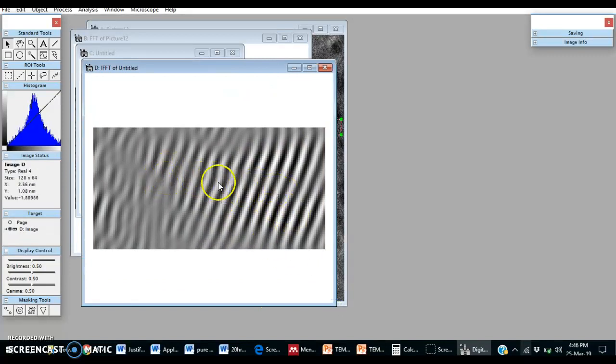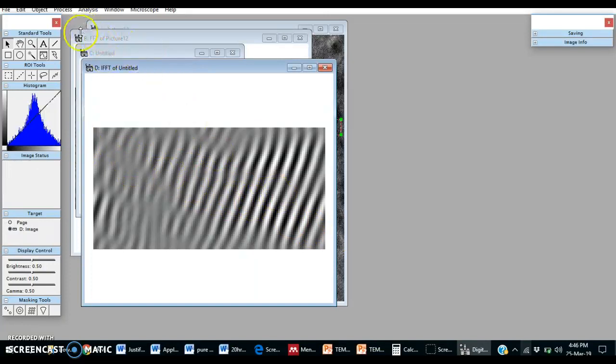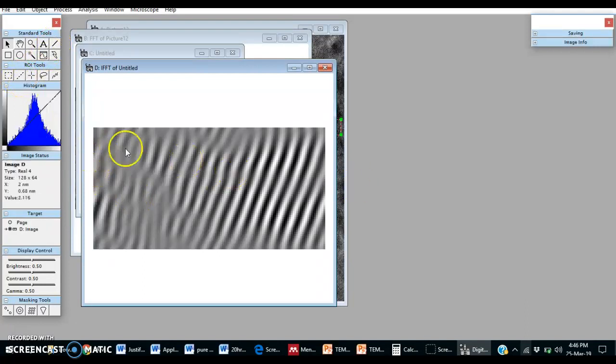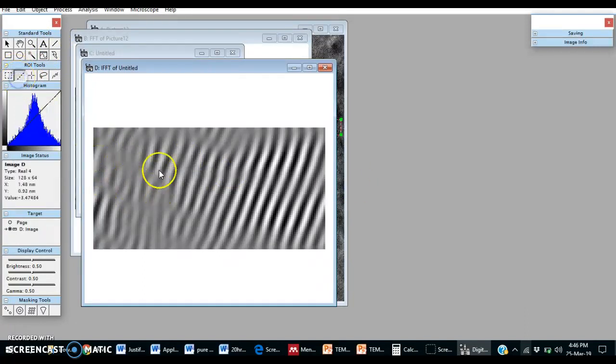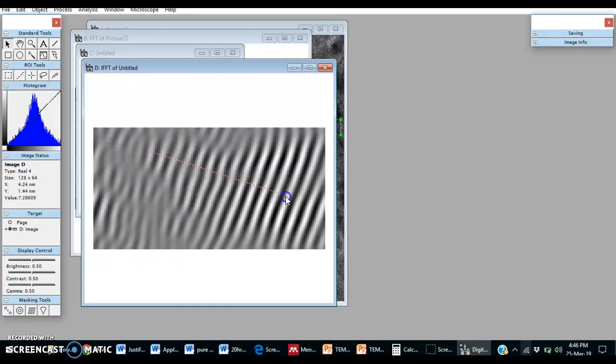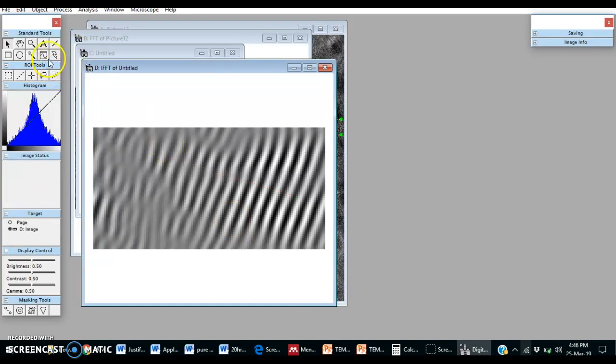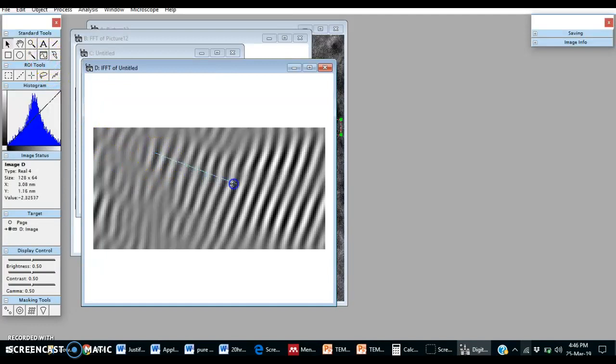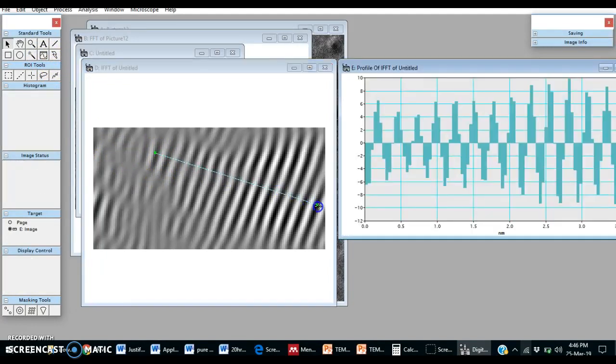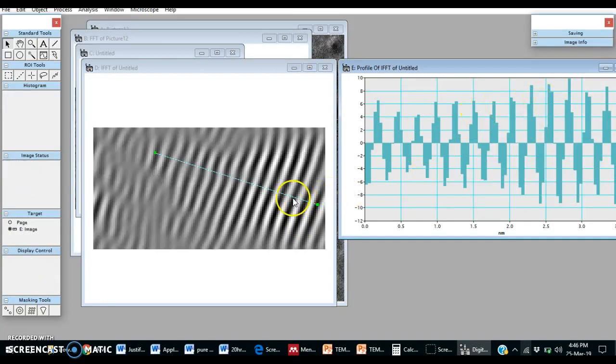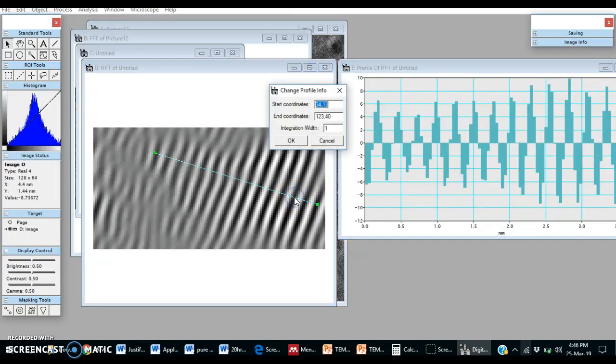We can find out interplanar distance, so for that we need to choose this tool. Double click on it.